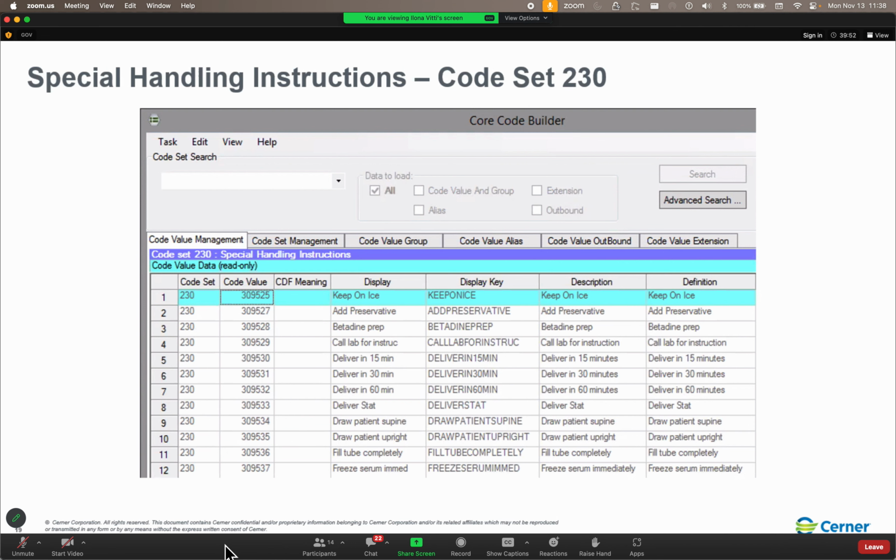We can configure accession classes for everyone, and we associate the accession format to the accession class. All of this is mainly done in the old school accession setup.exe. And folks, I do want to point out that there are a lot of notes under slide 29 that you really do want to take a look at.